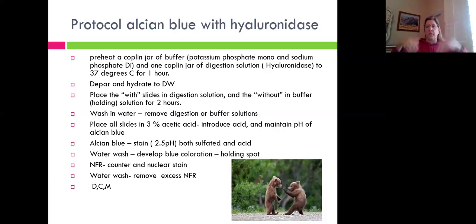But before you drop your slides, you're going to deparaffinize and hydrate. So you're going to deparaffinize and hydrate, then you're going to drop your slides. What this is saying is it's going to take about an hour for your Coplin jars in the water bath to actually heat up to the right temperature. In the meantime, you can deparaffinize and hydrate, do other things, and then come back, drop your slides, and walk away. Now, Carson says 2 hours.